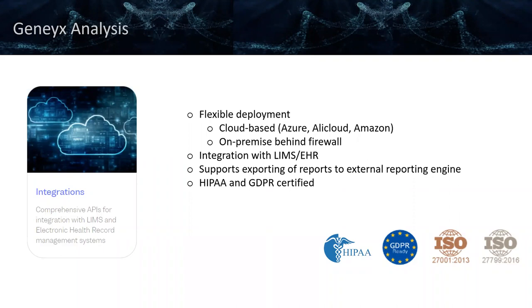And lastly, security is of primary importance. So we are HIPAA and GDPR certified. Our data is backed by encryption, so you can ensure that your data is not being accessed by third parties.